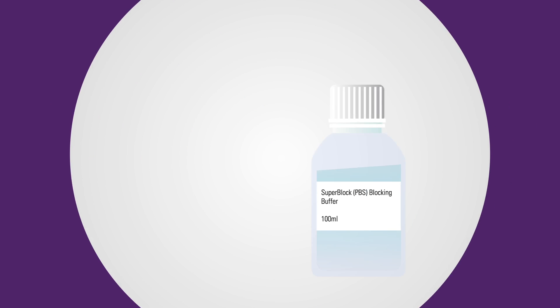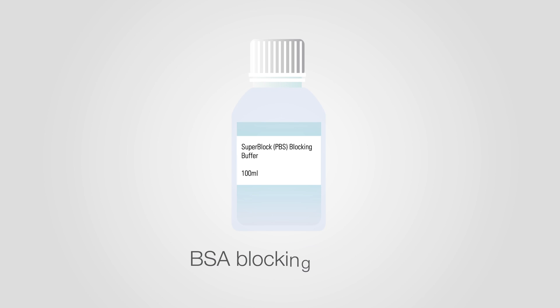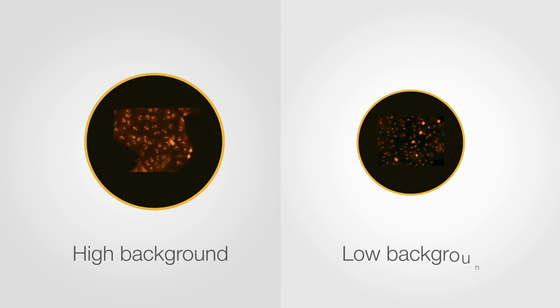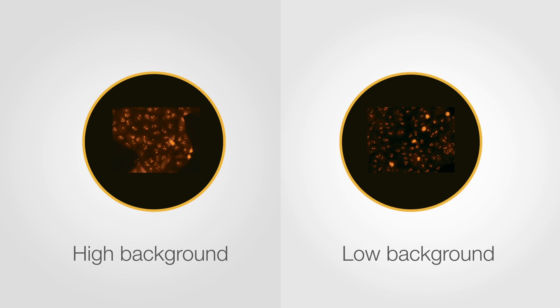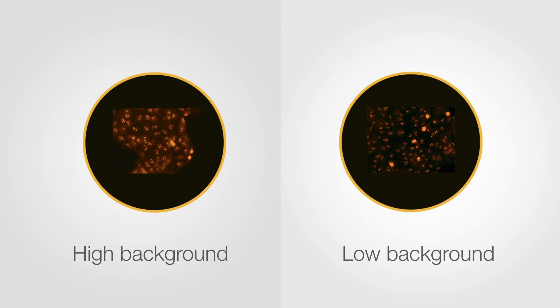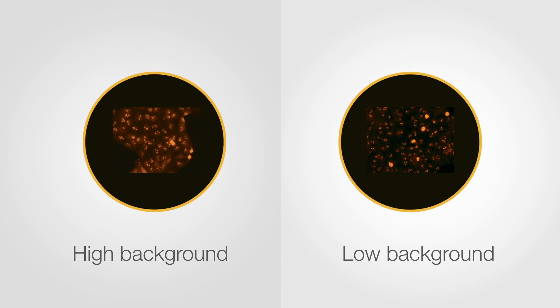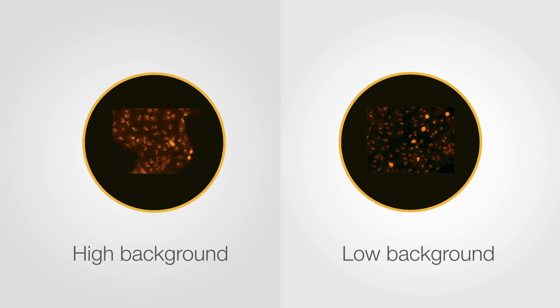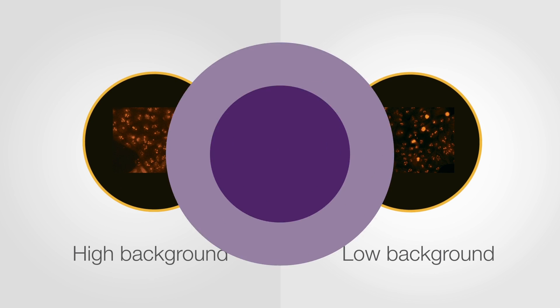A BSA blocking buffer or BSA supplemented with serum works better for phospho-specific antibodies. A milk-based blocking buffer would lead to high background signal as the antibodies bind to casein, a phosphorylated protein in the milk.